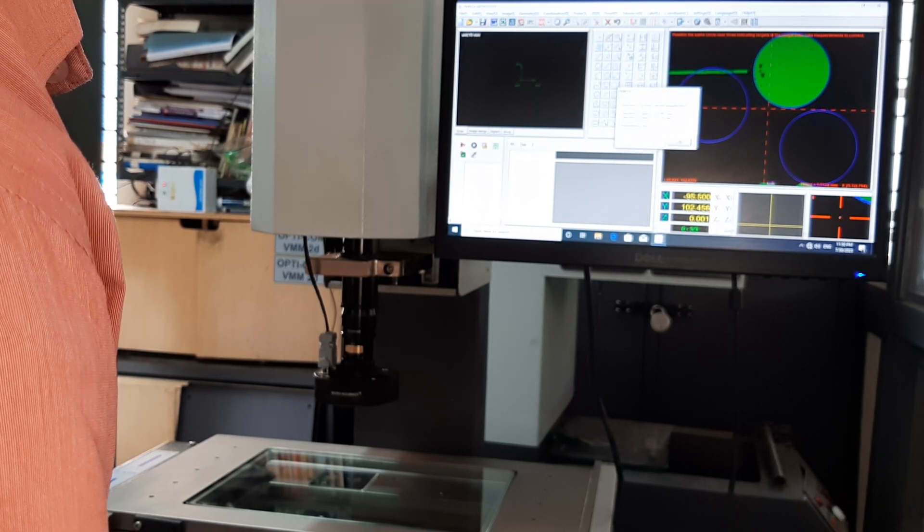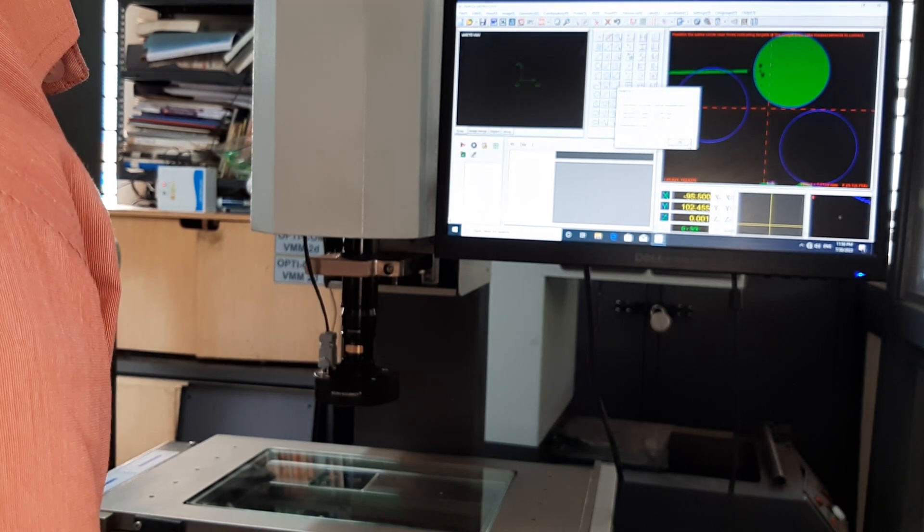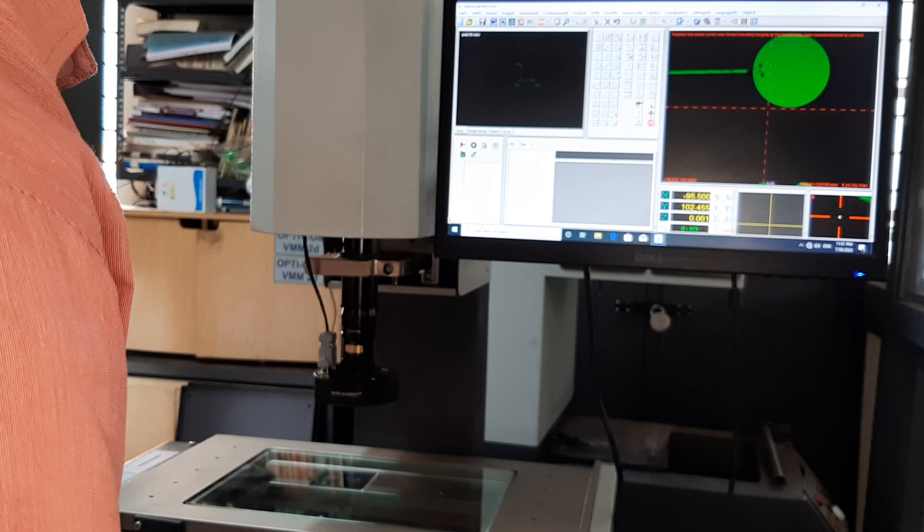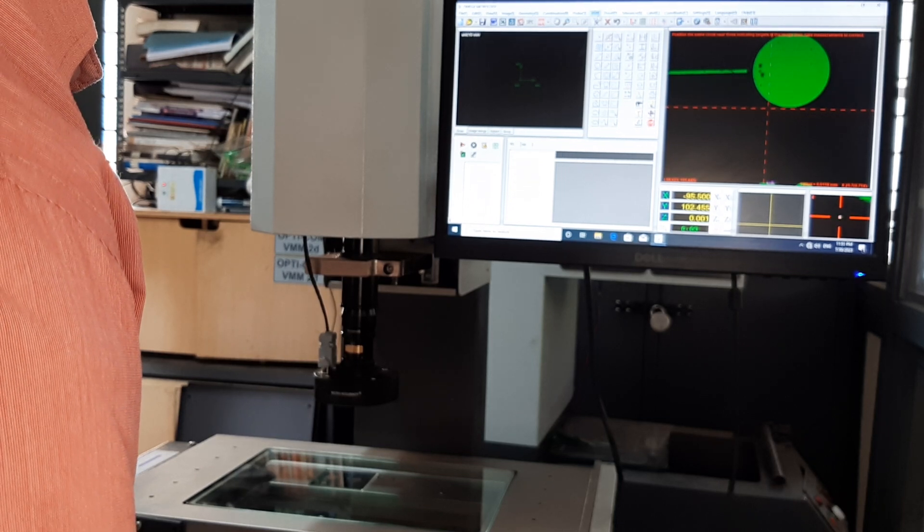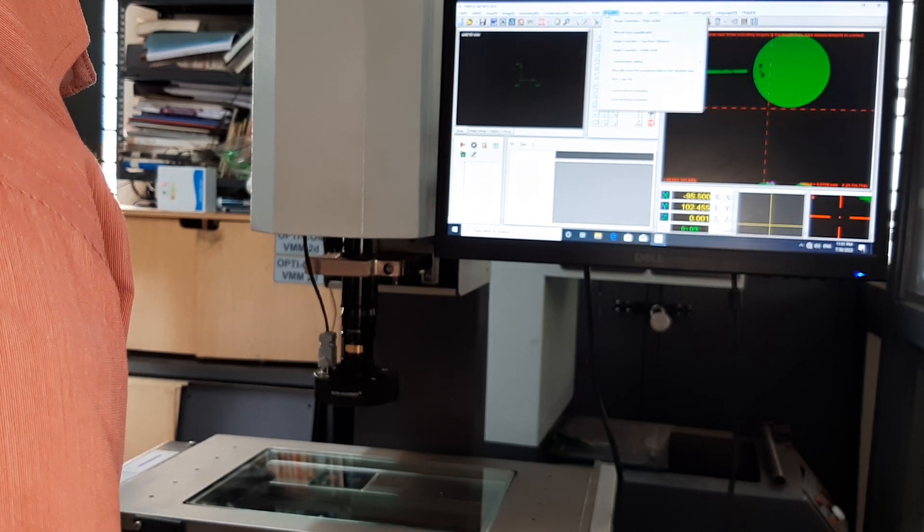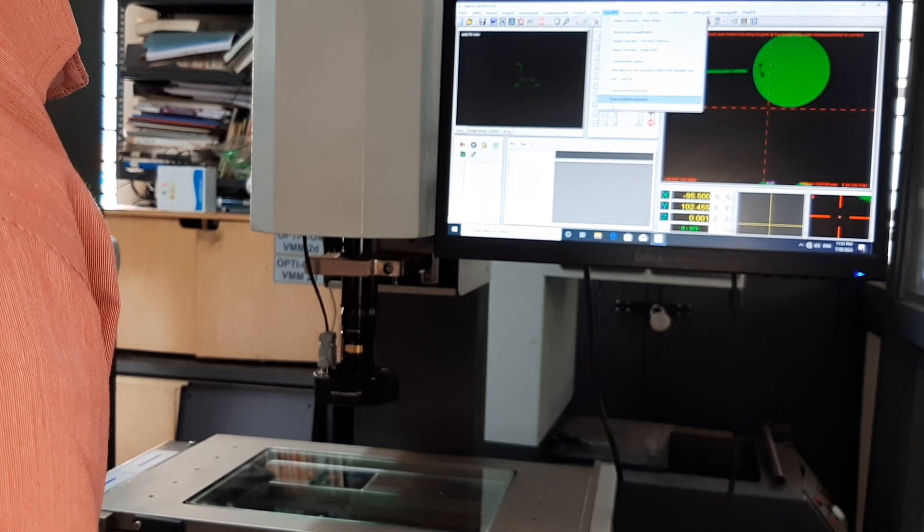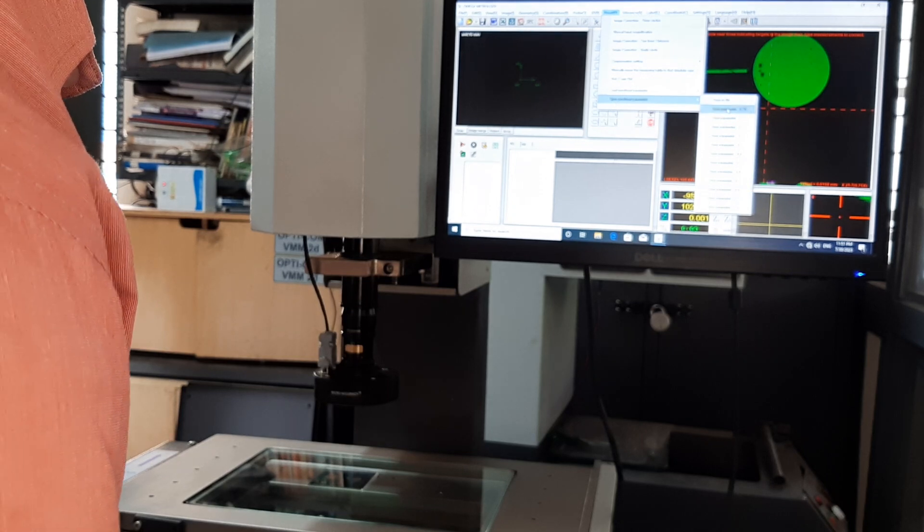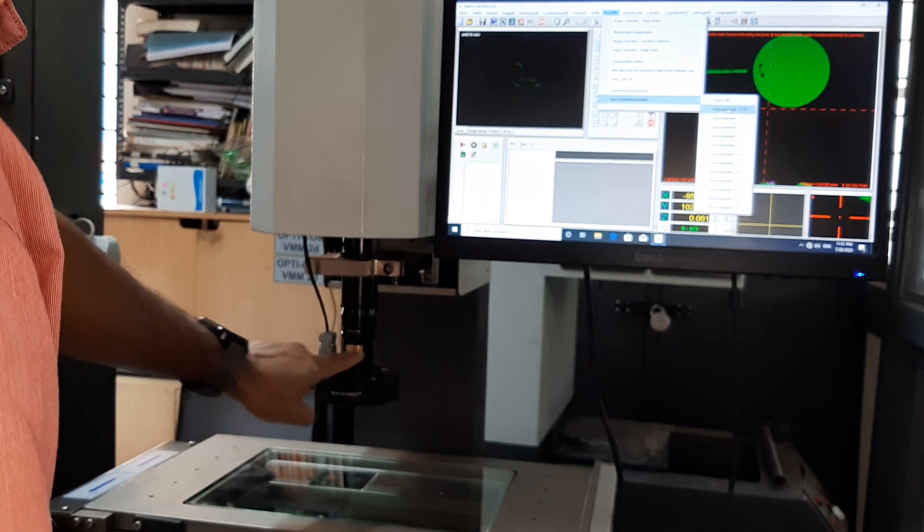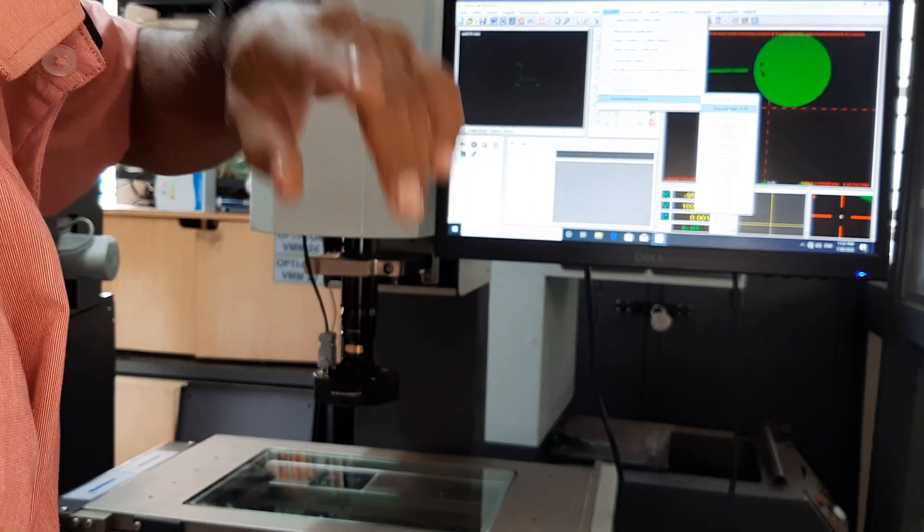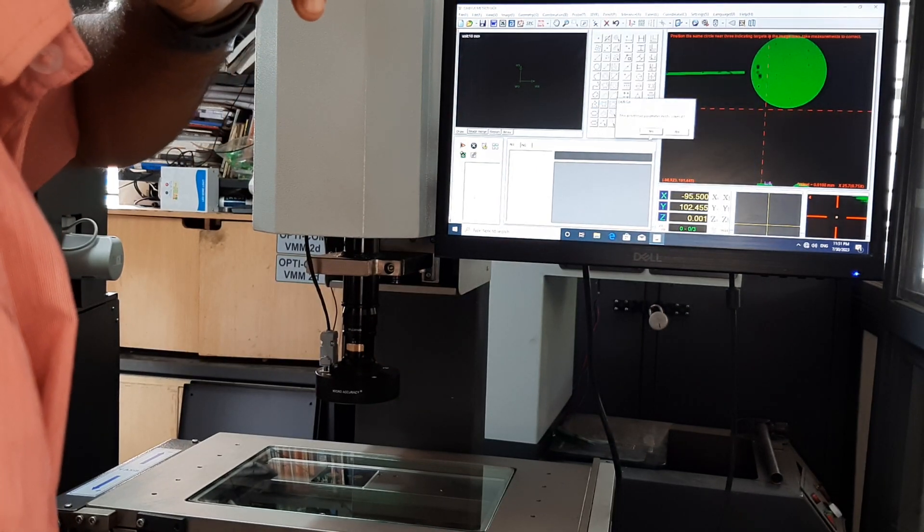You will get correction success. Now you need to save this value, so you go to login proof, save. 0.7, then the lens is also 0.7, and here save parameter is 0.7.